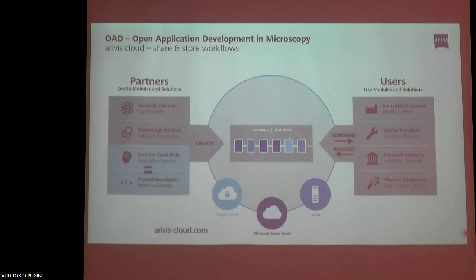And the good thing is I can generate my MATLAB script in a very old MATLAB 5 point some version, and you basically download it on your system and you will run it in a Docker container. So you don't need to have the MATLAB license. Yeah, it will be run in the Docker container, and all the licenses, this is paid by the Zeiss Foundation in the cloud. Yeah, that is a really cool solution.